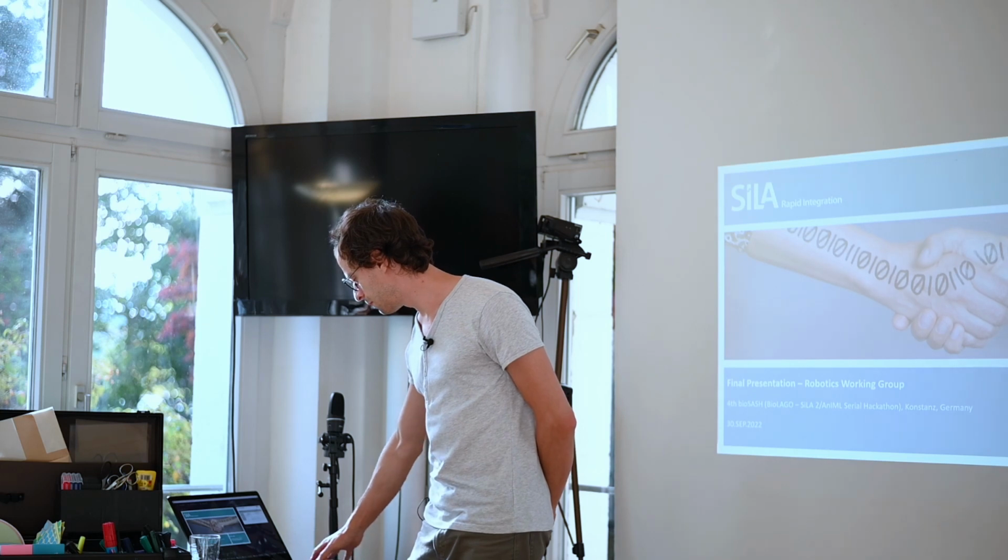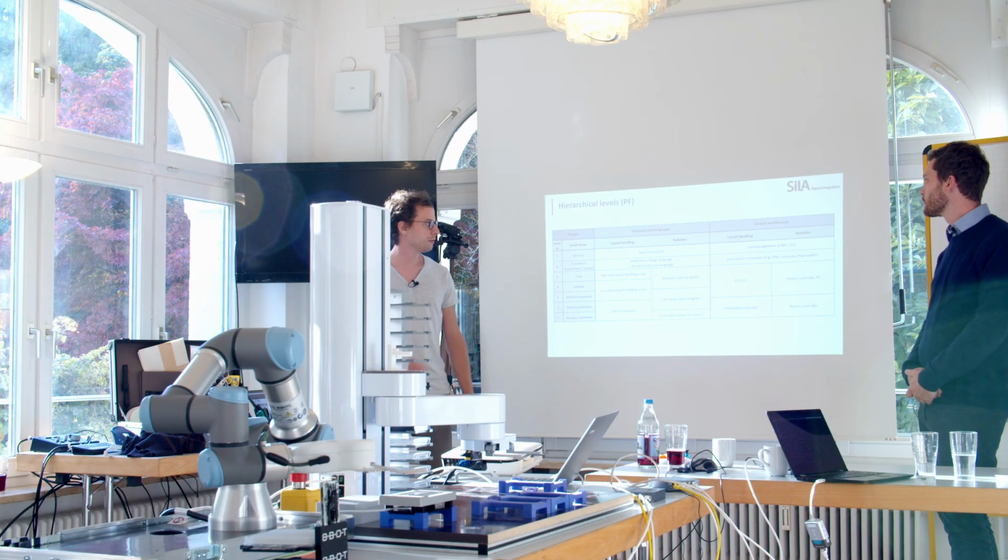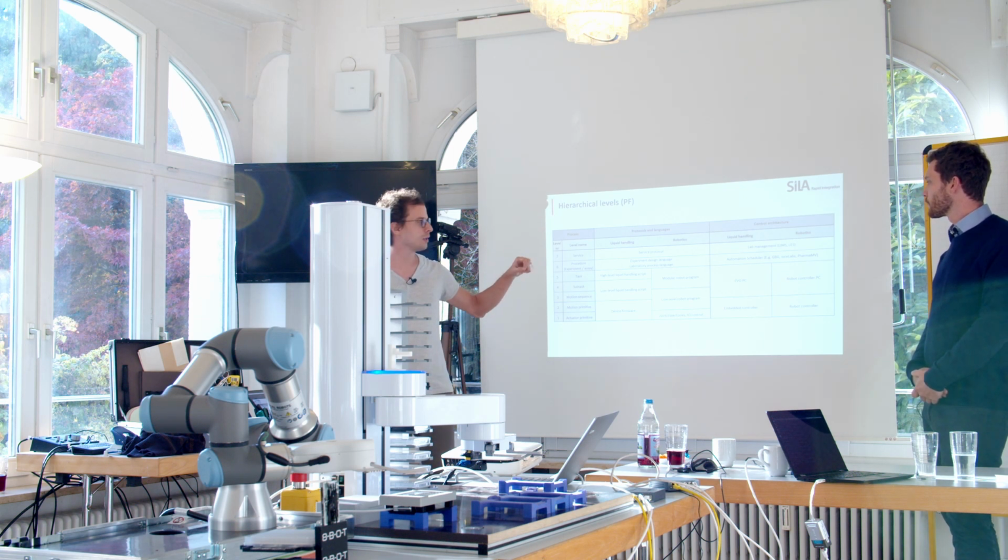So during the introduction on the first day, I presented the hierarchical levels of lab automation systems and also how processes can be decomposed.